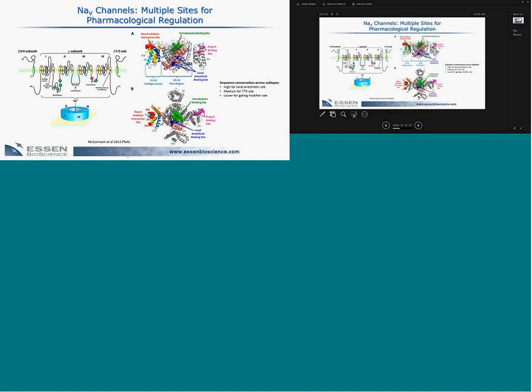You can then use this kind of paradigm to study all of the sodium channels. In this case, this shows simply block of the 25th pulse, and TTX shows what is fairly modest, but some, subtype selectivity, where you look at NaV1.8, it's not blocked at all at micromolar concentrations. NaV1.5 is, as expected, blocked in the low micromolar concentration. The other subtypes are all blocked in the nanomolar concentration range. What was kind of surprising to us was that there's actually a fairly large spread across this, and we were a little surprised at this, but it repeats quite well.